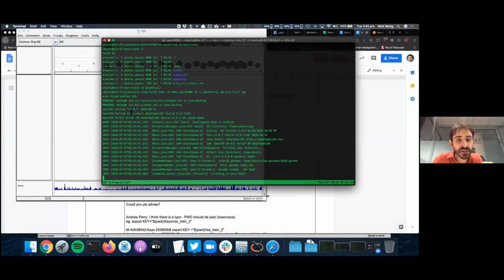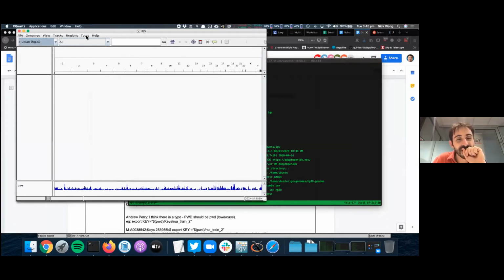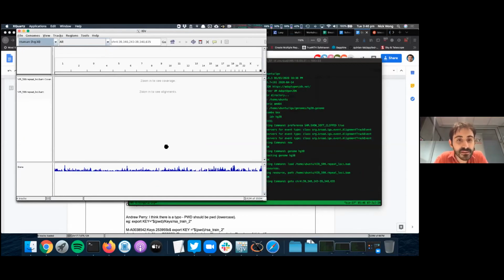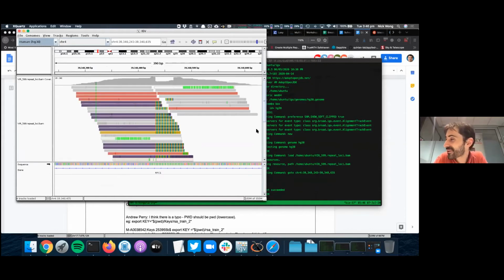You launched that with the same syntax, right? So you can go now in the tools menu of IGV, because I prepared a small example to run just so that we can see something. Actually, it's Sarah Beecroft, one of the facilitators, who prepared this example for me. So in tools, run batch script, it's batch.igv, and then you just click on open. It should take just a few seconds. It will load a genome, and now I'm out of my confidence zone.